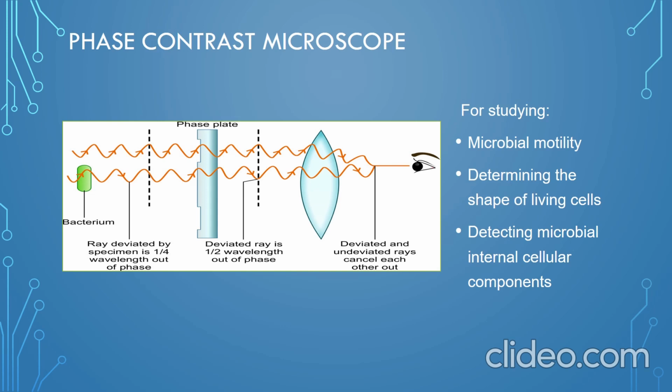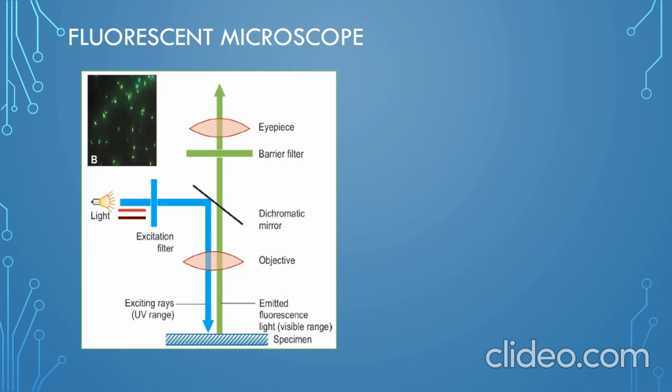So what are the uses of this phase contrast microscopy? It enables us to show components in a cell or bacteria. It is an established microscopy technique in cell culture and living cell imaging. It enhances the contrast between intracellular structures having slight differences in the refractive index. One of the major advantages of this microscopy is that living cells can be examined in their natural state without previously being killed or fixed, as in our electron microscopy.